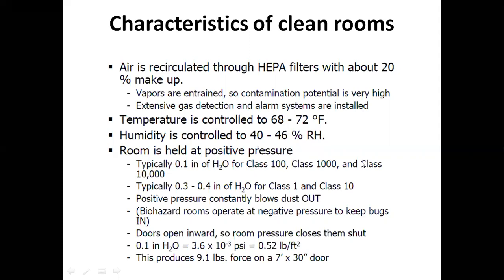The clean room is maintained at positive pressure because if it is at negative pressure, then the air from outside would enter the clean room through door cracks or holes, and also when we open the door, the air comes inside. So normally, if it is at negative pressure, all that air would enter the room. That air would not be clean. It would have dust.